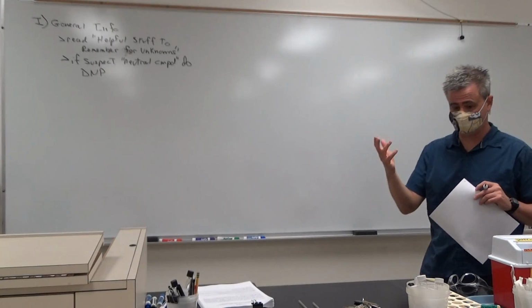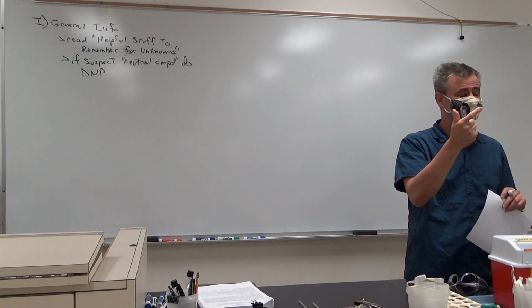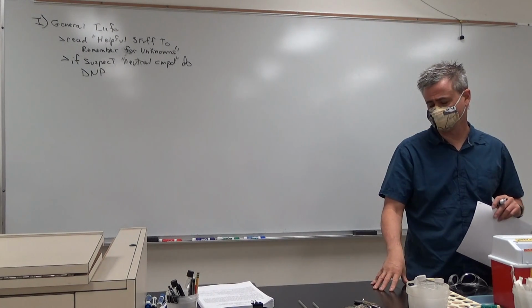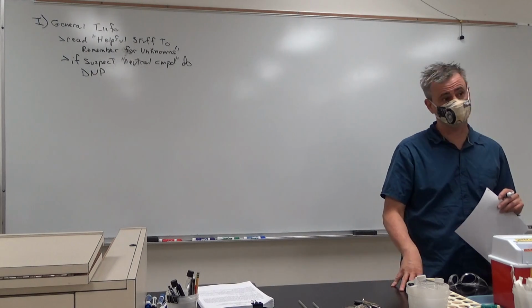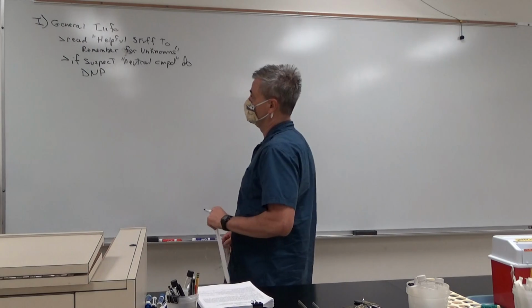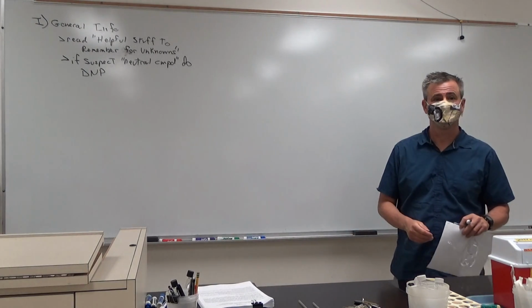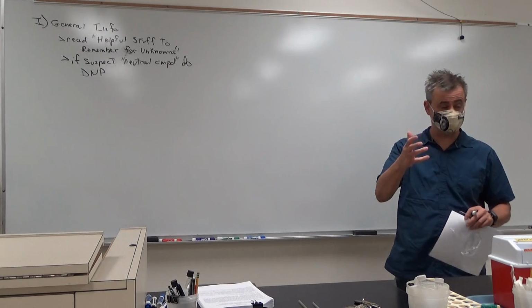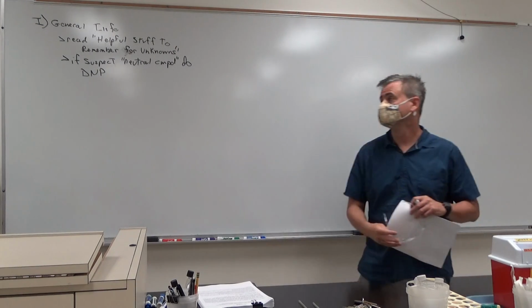If that comes out negative, then you know it's an alcohol or an ester. We don't have a test for esters. You come to the conclusion that you have an ester by a process of elimination. You rule out ketones, aldehydes, and alcohol.